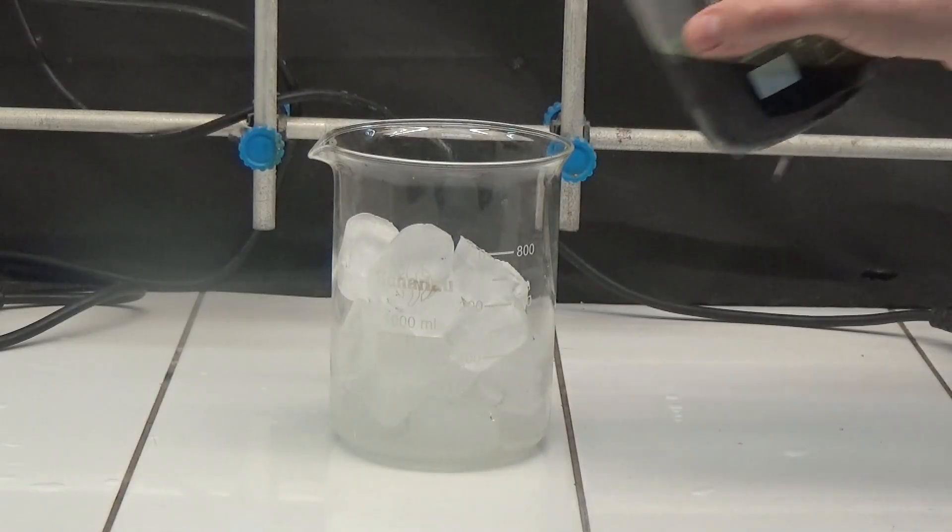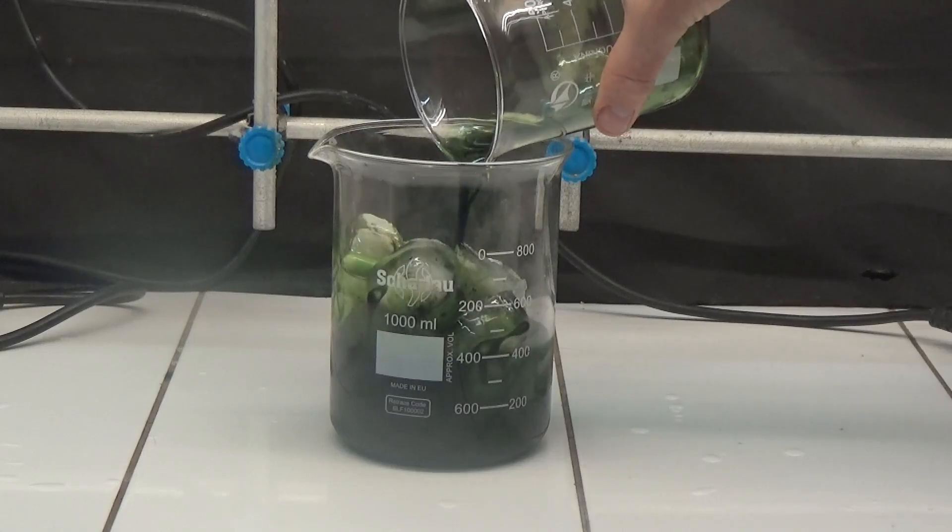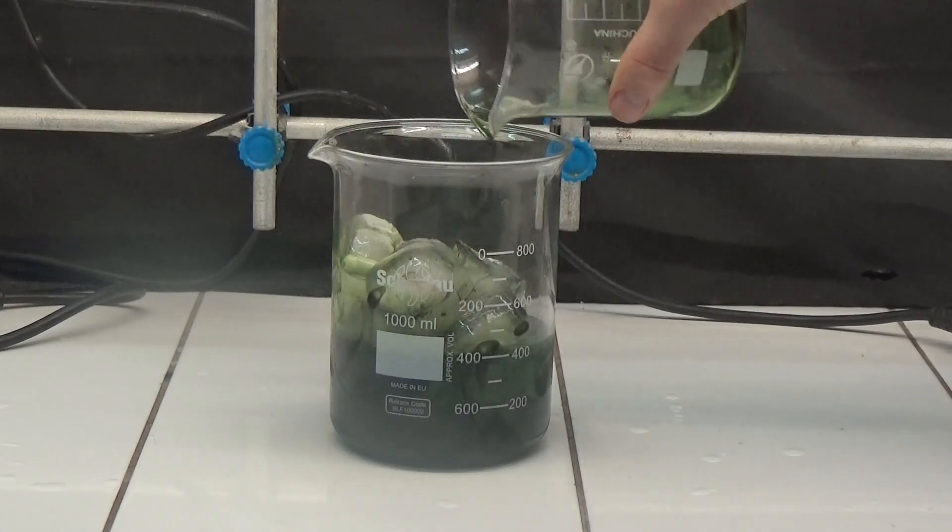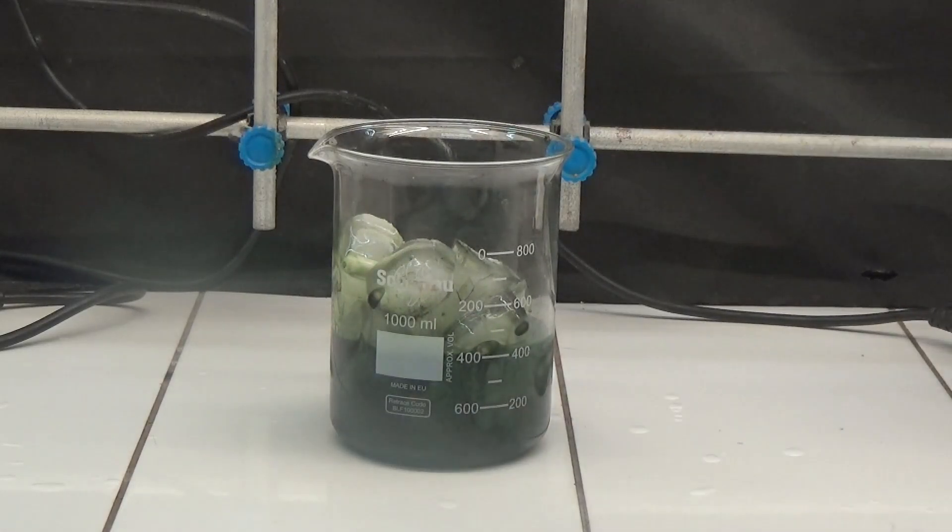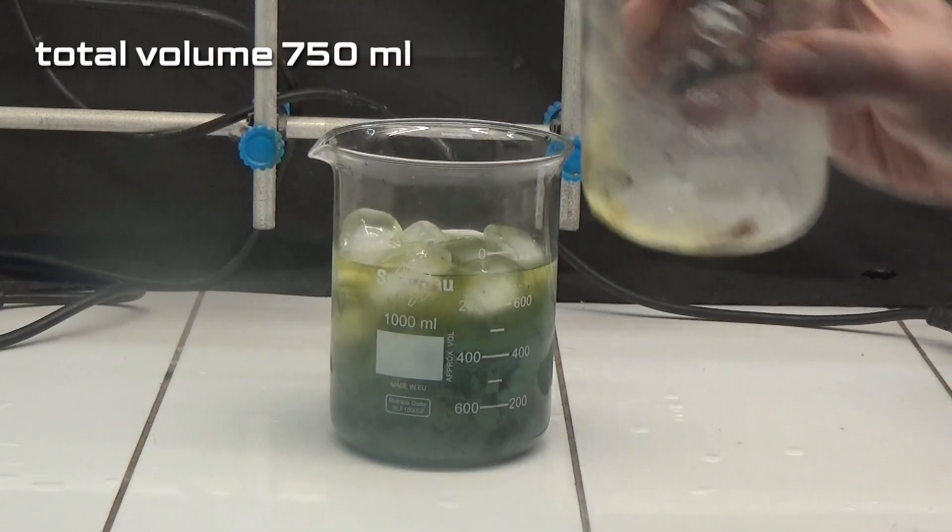The mixture is poured into a 1000ml beaker containing 2 thirds of its volume of ice. The total volume should be 750ml, if necessary add water.